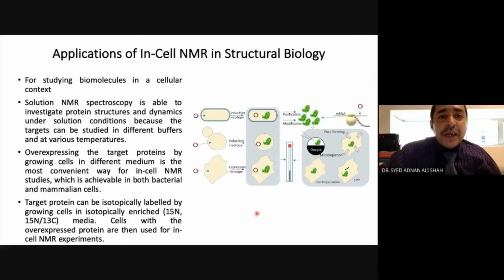Now, the application of in-cell NMR in structural biology. NMR plays a very important role in in-cell studies. First is the overexpression of these proteins, and then the cells are grown in N15-labeled media, then put into the sample tube and subjected to NMR, and then identify what's going on in the cell.